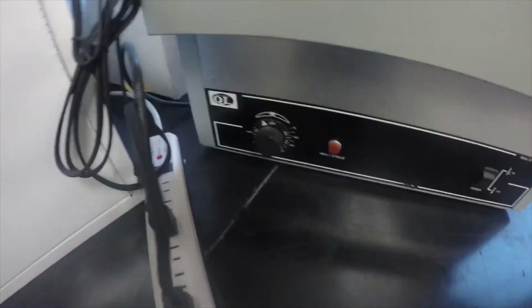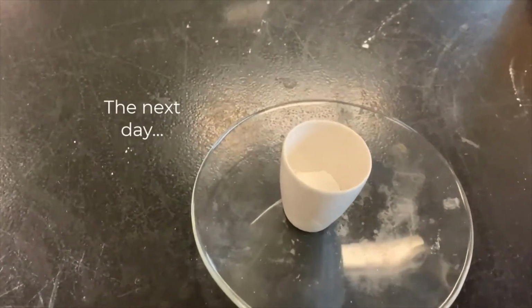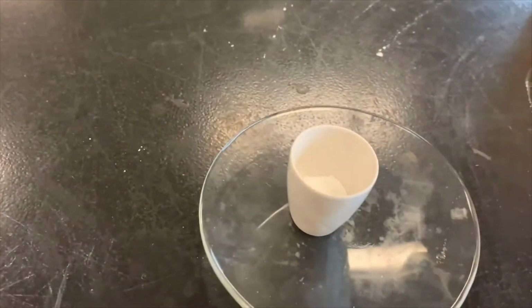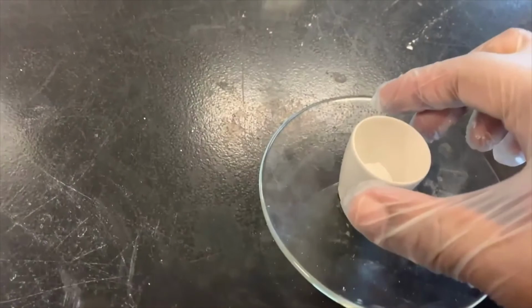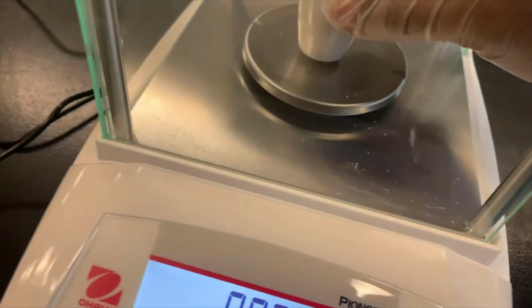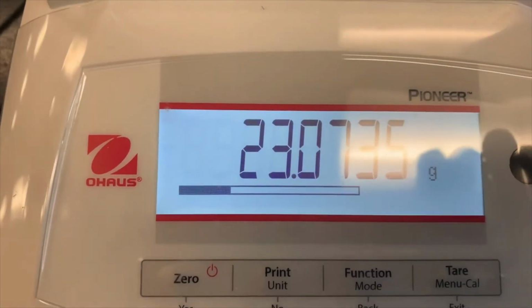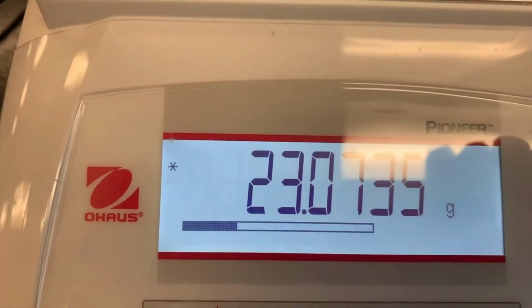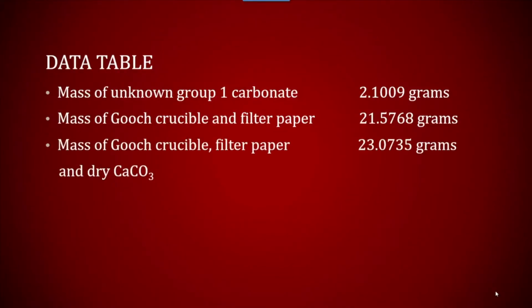we'll heat that overnight. Okay, so at this point we're going to measure the mass of the dried calcium carbonate that I removed from the oven. So place it on my scale. And the current reading is 23.0735 grams. Again, this is the mass of the Gooch crucible, filter paper, and the calcium carbonate.